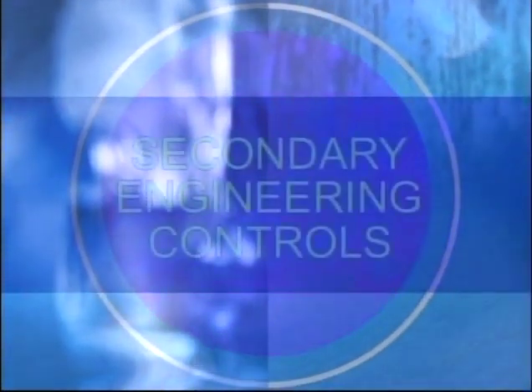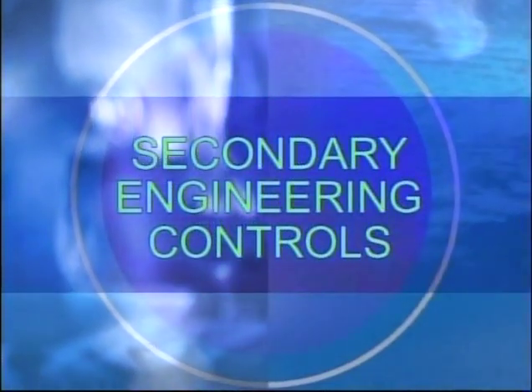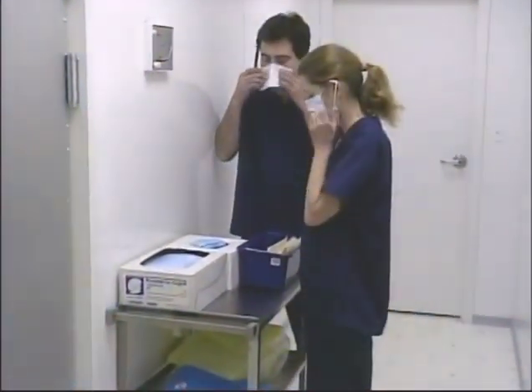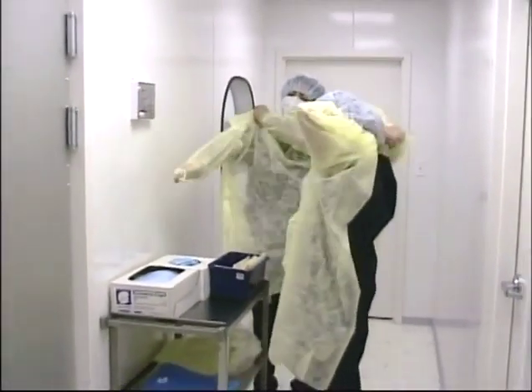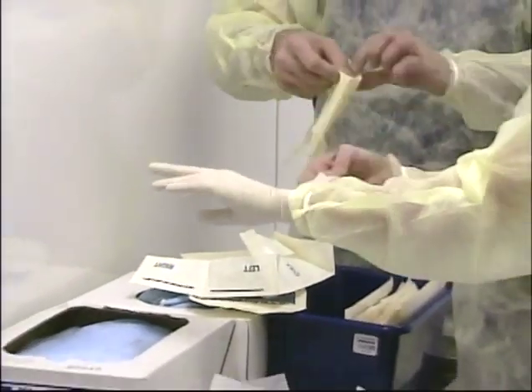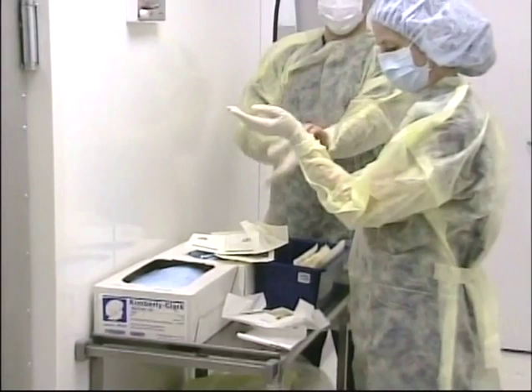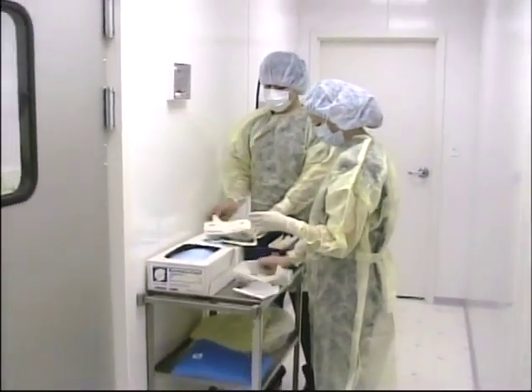Secondary engineering control should be employed to provide a buffer zone as an essential controlled interface between the hoods and the outside environment. A gowning anteroom or designated area should be included between the buffer zone and the outside environment, where preparation and staging of all working materials, gowning and scrubbing, and degowning at the conclusion of operations may be carried out. The level of secondary engineering control varies from institution to institution.